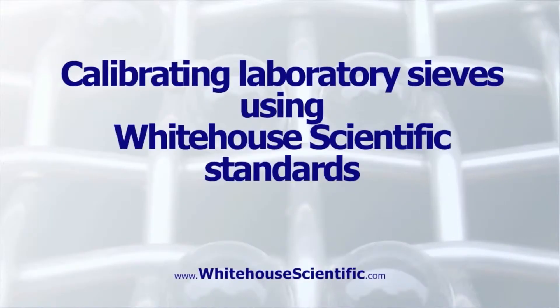Here is a video courtesy of White House Scientific that demonstrates a calibration procedure using microspheres — calibrating laboratory sieves using White House Scientific standards.